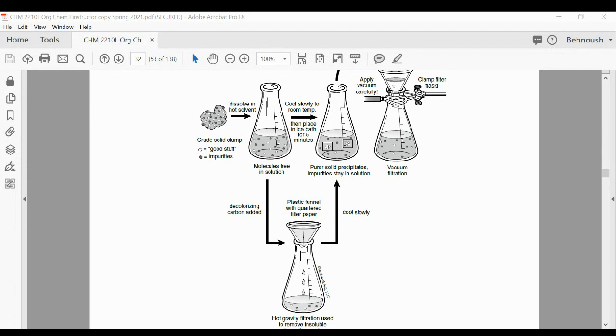Caleb, could you tell me what's the characteristic for a proper crystallization solvent? What is a good solvent for crystallization? What characteristic makes a solvent a good solvent? Not yet, no. I have not.